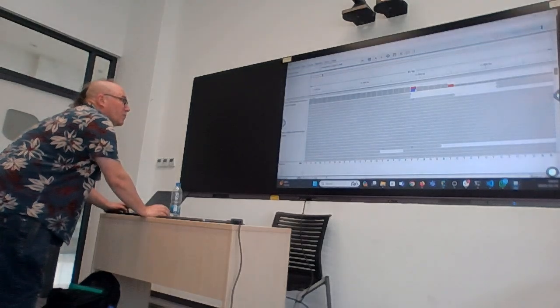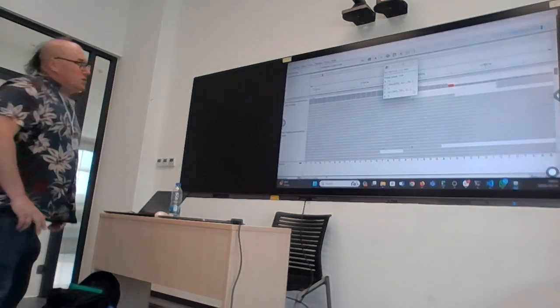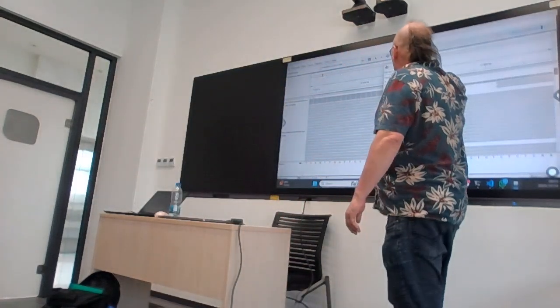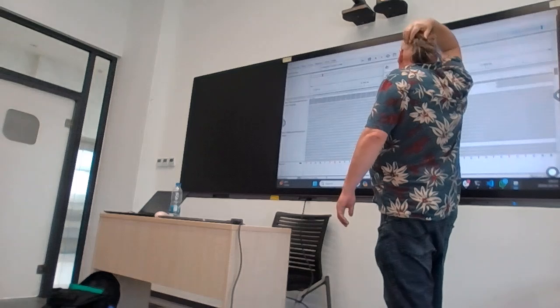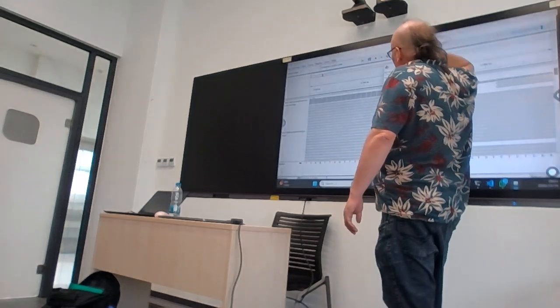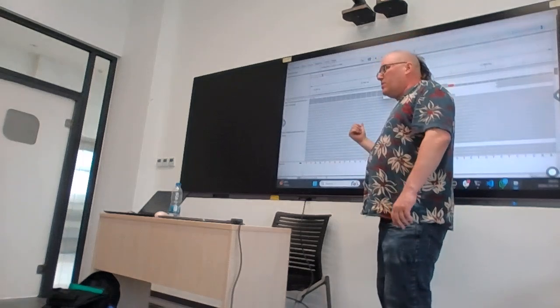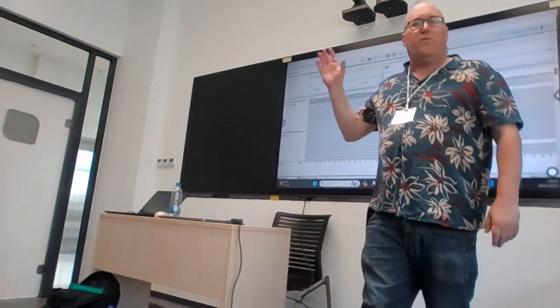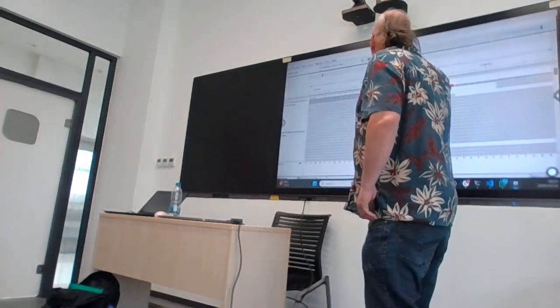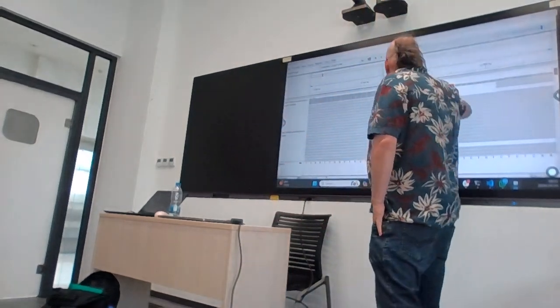this is 12849. If I move the mouse here, position 12849, okay? And it's interesting because the numbers here don't match the VCF. I'm going to ask the authors why the numbers don't match the VCF. But we see here that this is showing C's and T's.